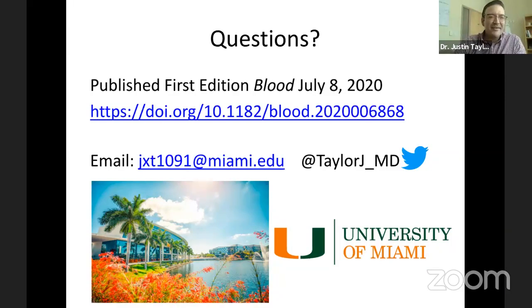Yeah, you can do it. There's a very difficult way to do it, which is single cell colony assays, where you take some of the bone marrow cells and you split them up into single cells, and then you can grow them in a special media that makes them into single cell colonies, and then perform sequencing for each of these alleles in those colonies, and you do that for hundreds of colonies so that you can basically re-represent what you're able to do very quickly on the Mission Bio Tapestry platform.